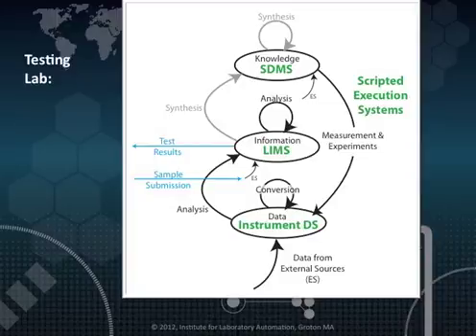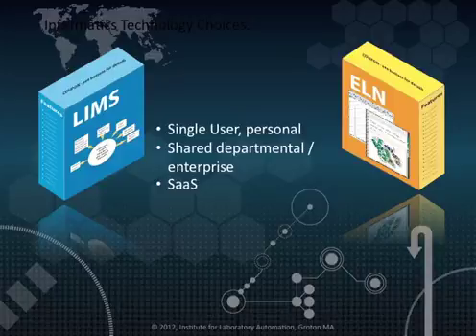For example, we may want, as part of the product requirements, to automatically have the results sent to the sample submitter instead of requiring the analyst to carry out that as a separate step. In addition to looking at product capabilities and requirements, we also need to be aware of how systems are going to be implemented and what kind of technologies we want to take advantage of. There are a number of trade-offs that can be made between cost, ease of implementation, security, and other factors.